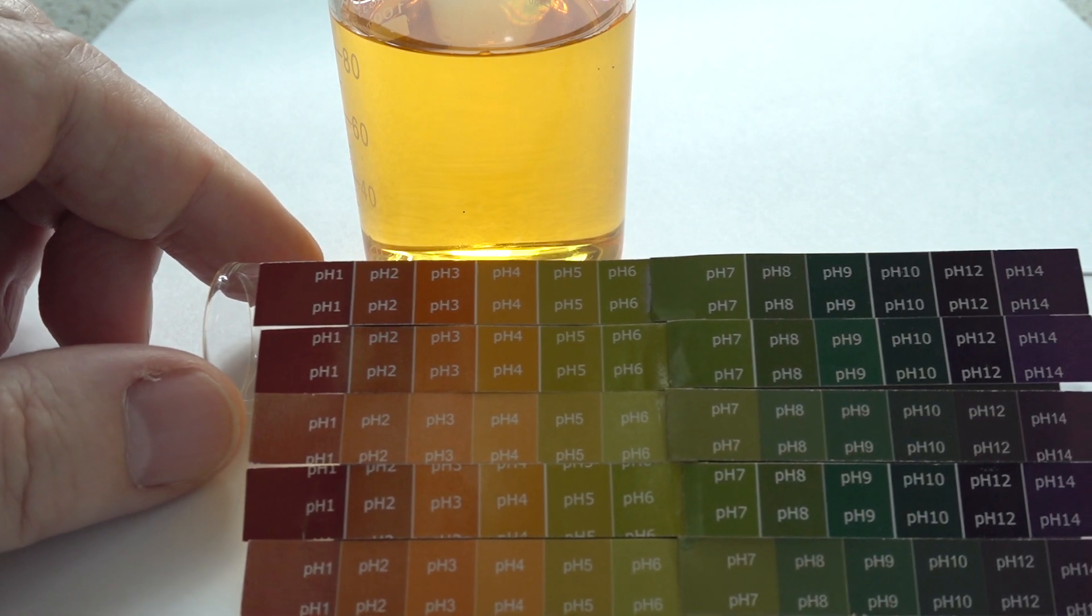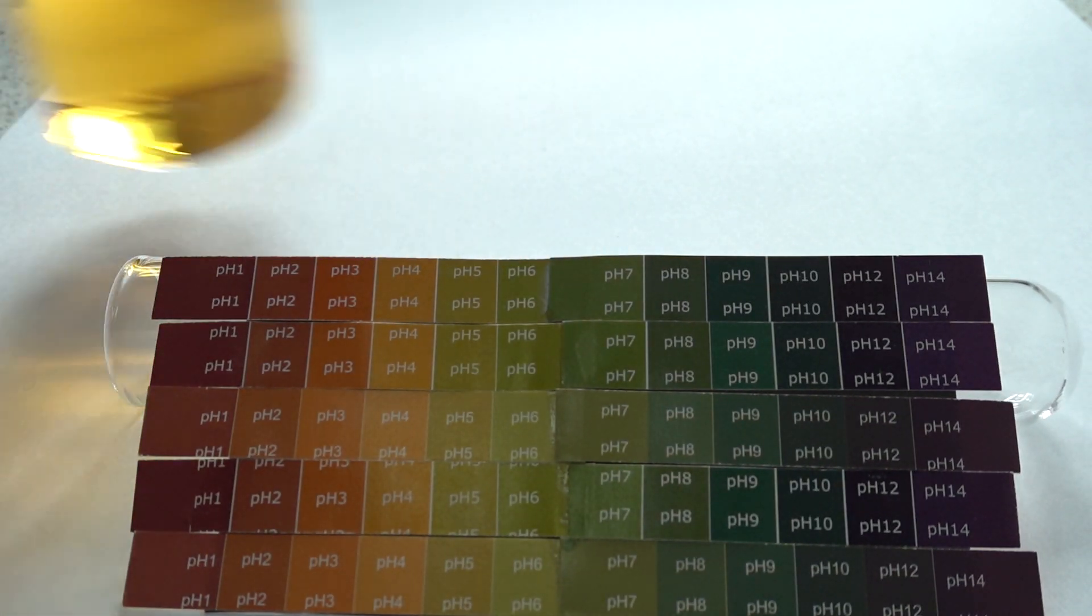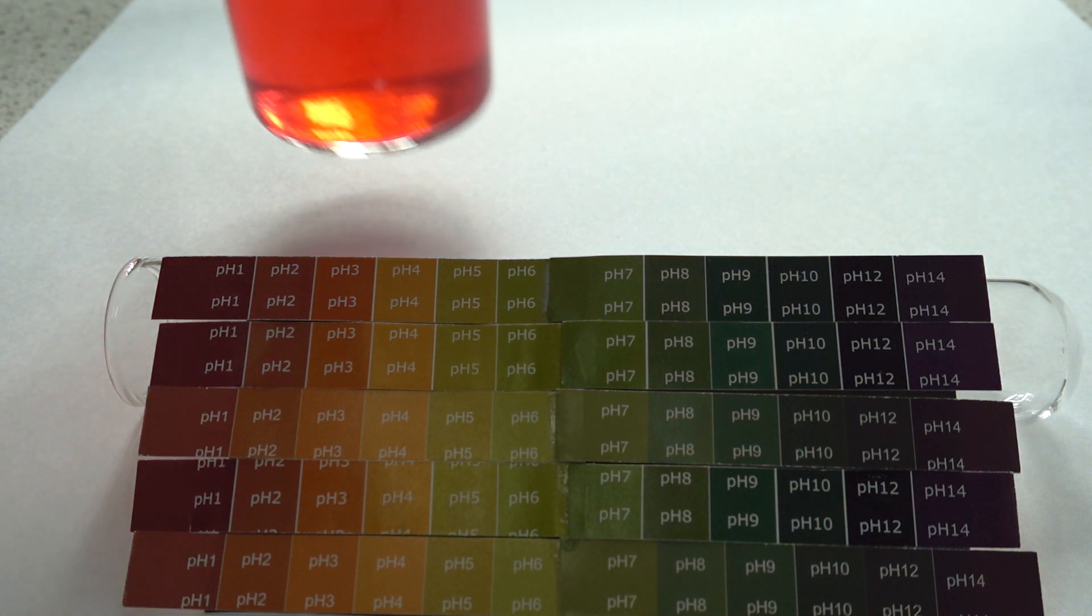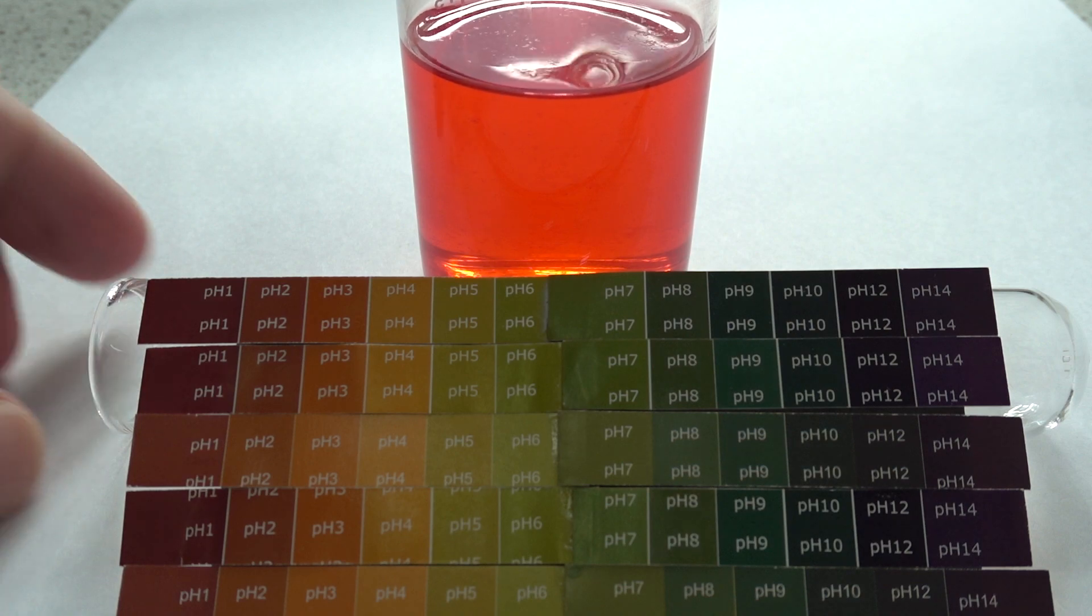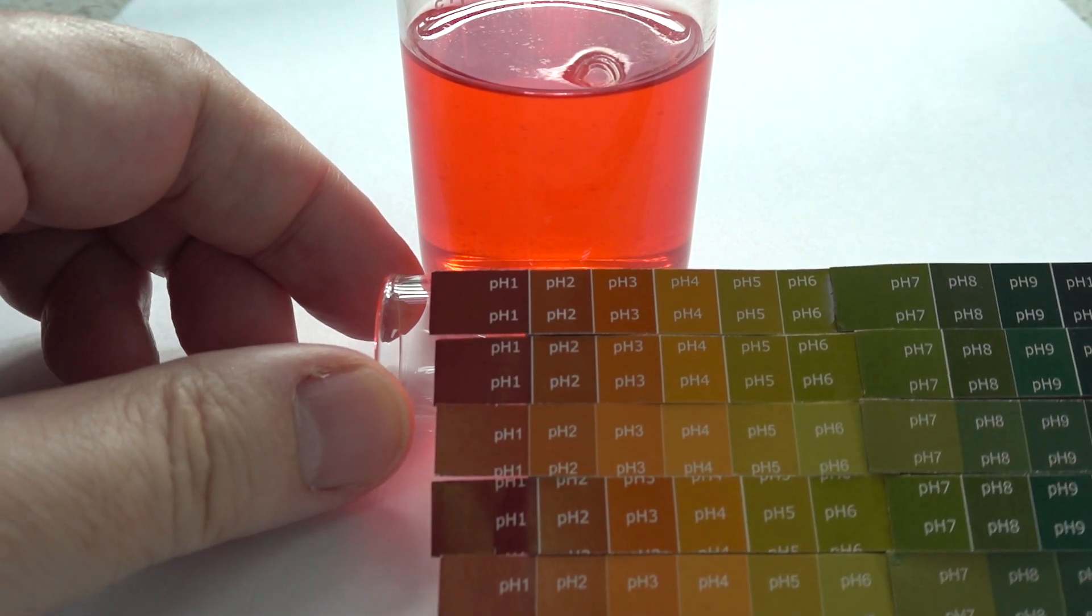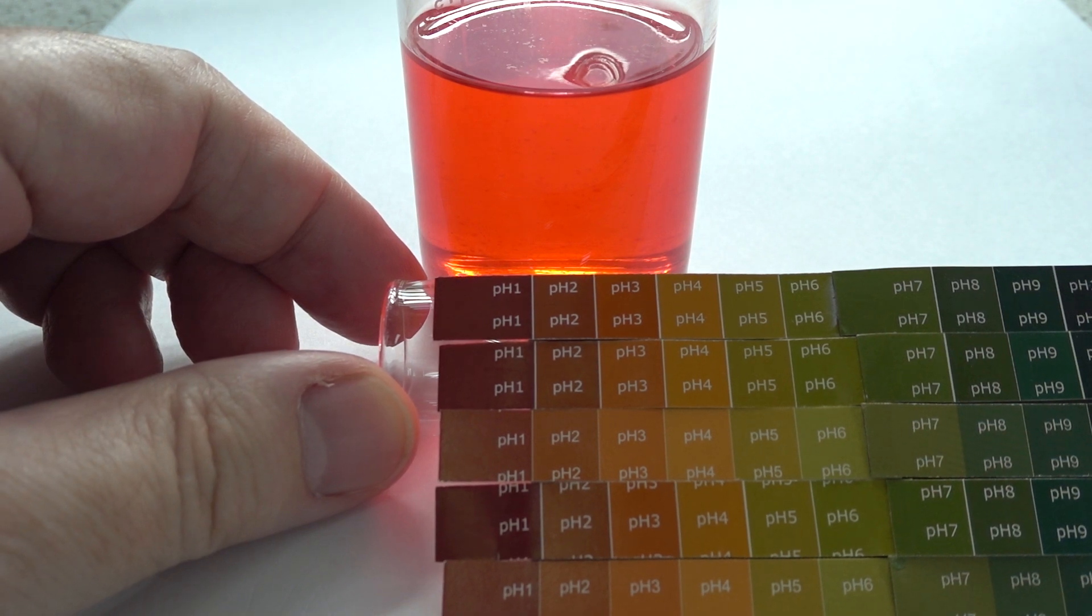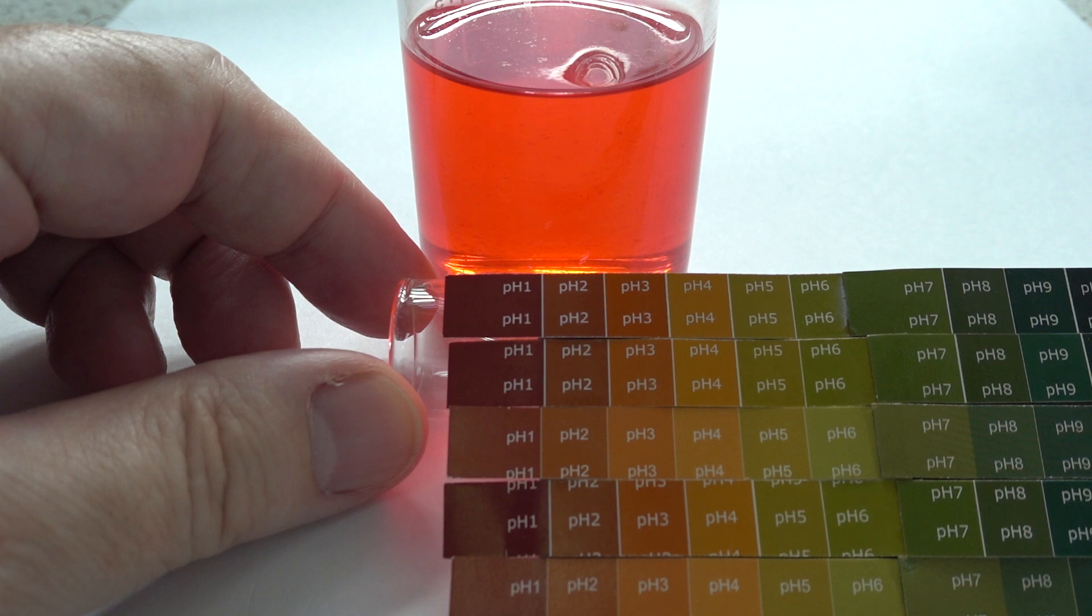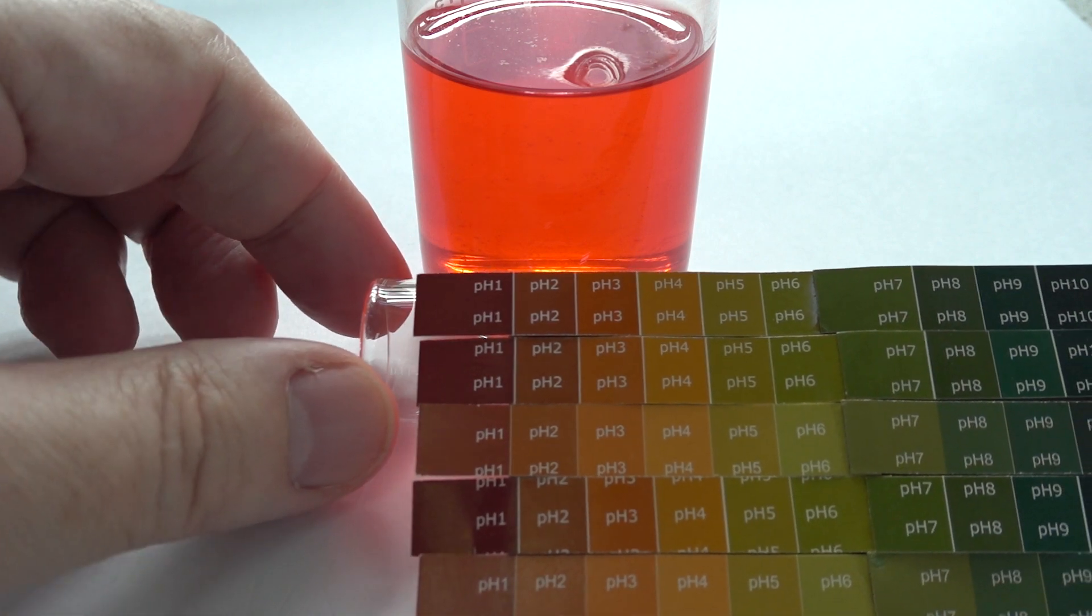Our second solution, this one much deeper in color. It's red, got some reflection of light at the bottom. We might be tempted to say that's pH 2 or even 1, and it's clearly a strong acid.